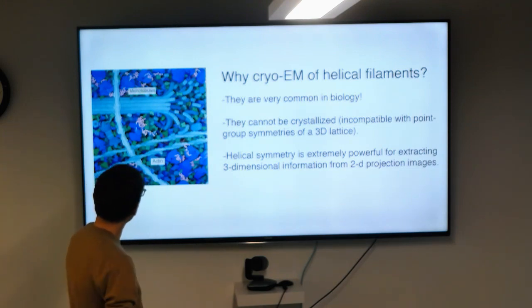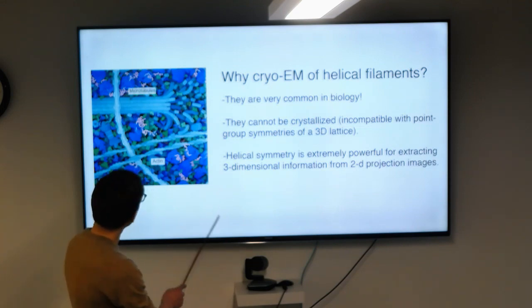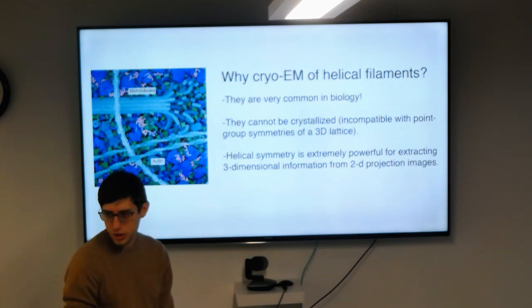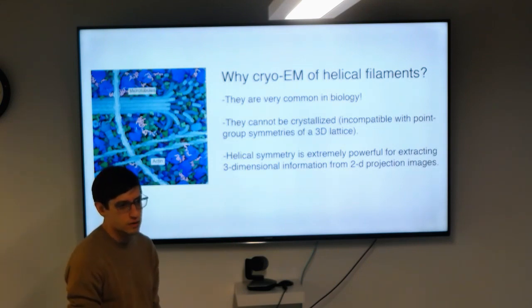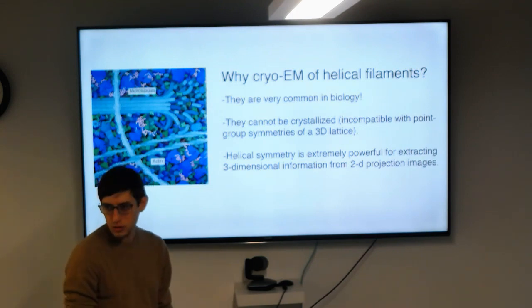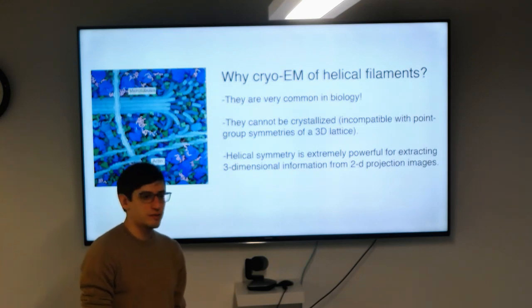The final reason I'd say that it's useful to study helical filaments is that the helical symmetry of these filaments is really powerful for extracting three-dimensional information from two-dimensional projection images of objects. And actually, this was really important in the historical development of EM, and so I'll come to that in a minute.